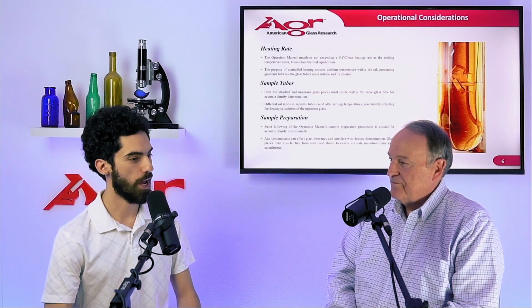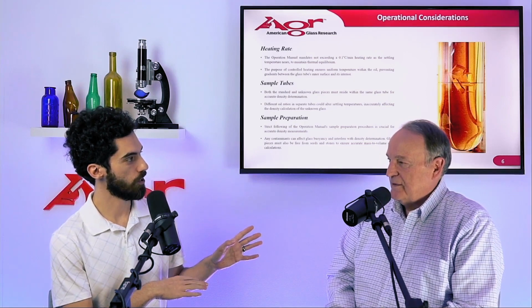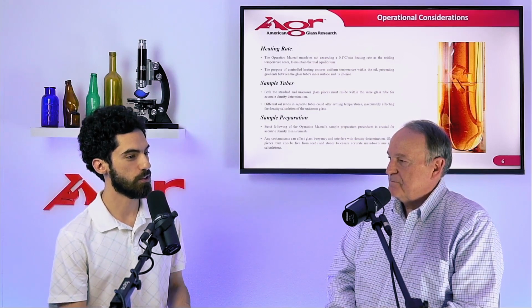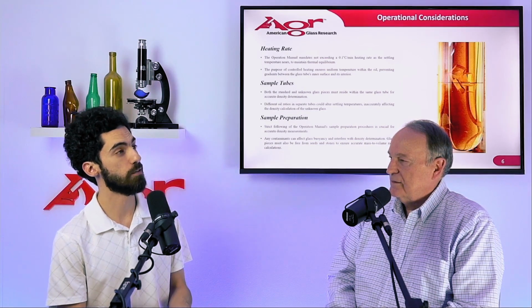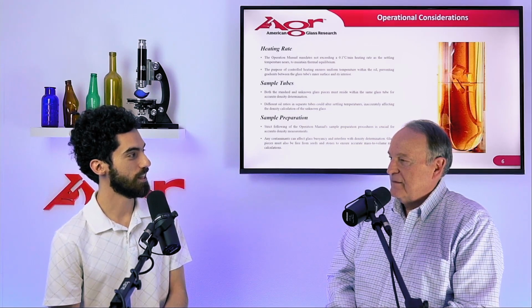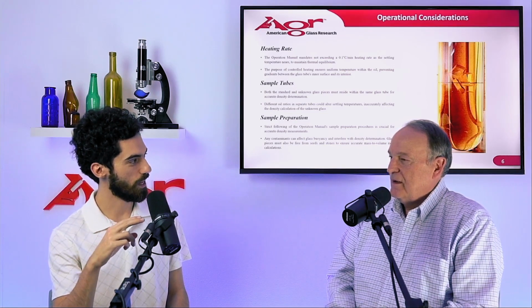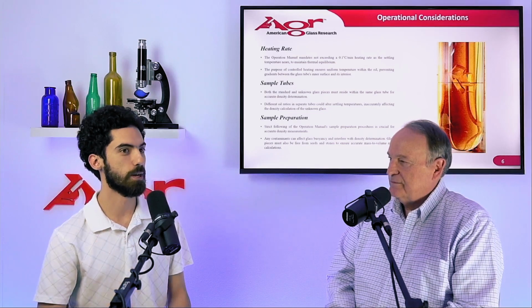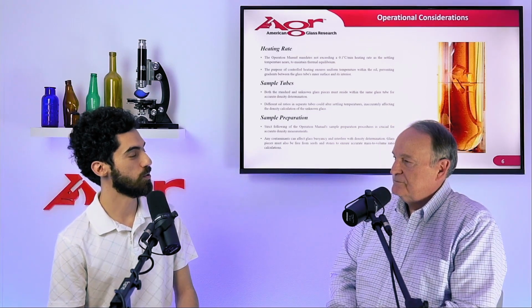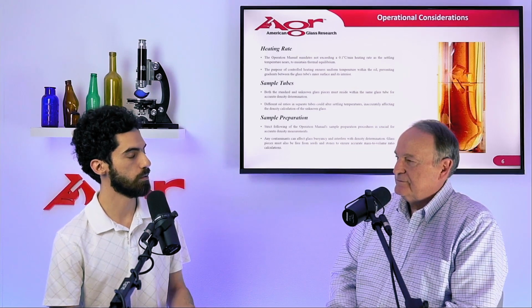So manual, bring it down to fairly close to what is expected, about a centigrade away, and then turn on automatic. Because you don't want to be waiting. At 1/10 of a centigrade per minute, waiting for a whole centigrade is 10 minutes that you're sitting there, actively watching the glass pieces fall across. That's important. We don't want to be sitting there too long, but we also don't want to upset the balance of the test and the equilibrium in the tank.